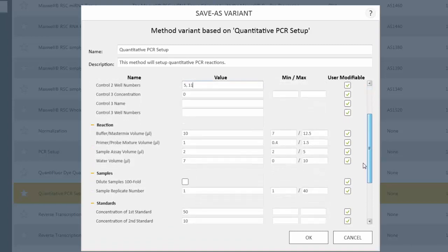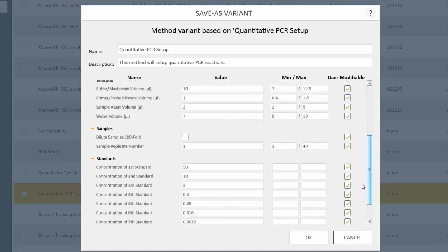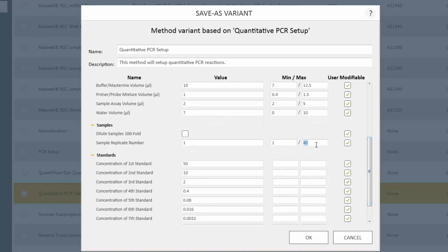The Maxprep liquid handler will prepare the reaction master mix automatically according to the volumes indicated in the protocol. The protocol can be set up to indicate the number of replicates that are allowed. In this example, we will set the default number of replicates to 2 per sample.